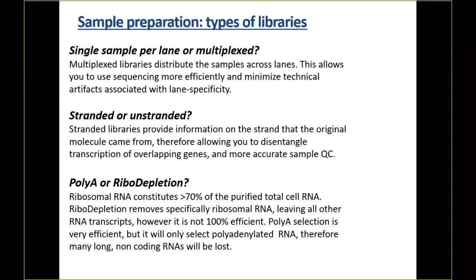So what's a major disadvantage of poly-A? If you do poly-A, you're doing basically a positive selection for what? mRNA, yes. Poly-A pull down is going to specifically pull down mRNA.